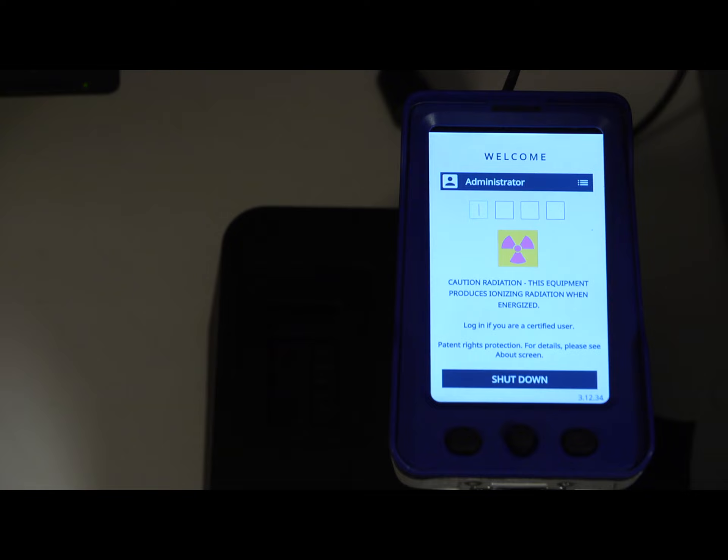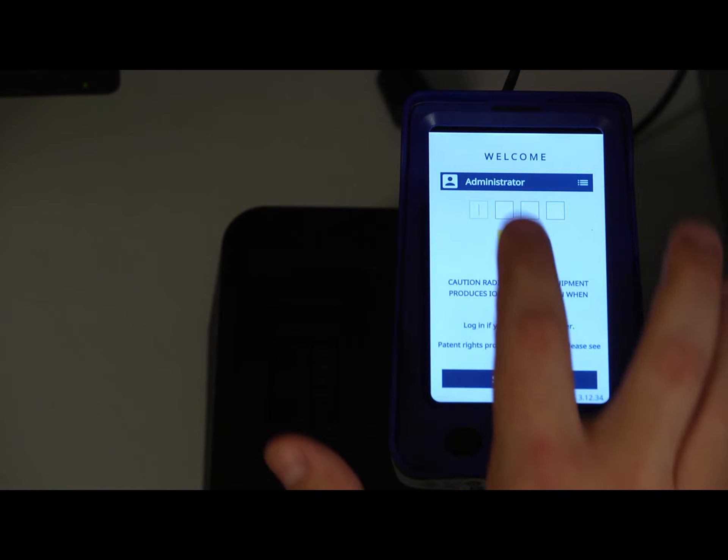Hi, I'm Andrew Cardamoni, and today I'm going to show you how to use the GPS feature on the Vanta. The GPS will allow you to collect live location data when you're collecting samples in the field, as well as export these coordinates for any sample mapping or other needs that you may have.